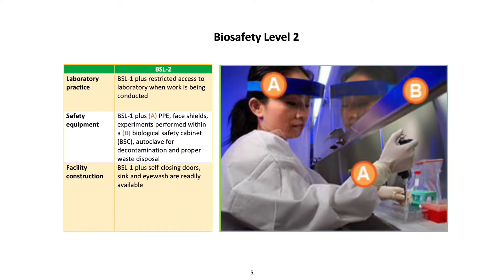BSL 2 laboratory practice: BSL 1 requirements plus restricted access to laboratory when work is being conducted. Safety equipment: BSL 1 plus face shields; experiments performed within a biological safety cabinet; autoclave for decontamination and proper waste disposal. Facility construction: BSL 1 plus self-closing doors; sink and eyewash are readily available.